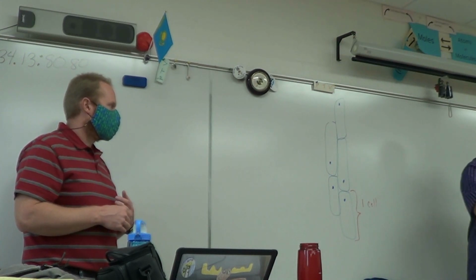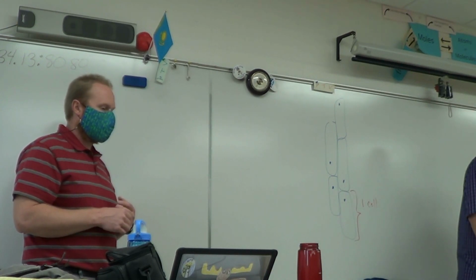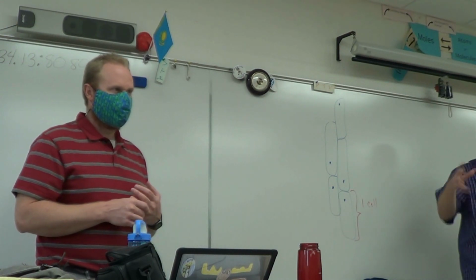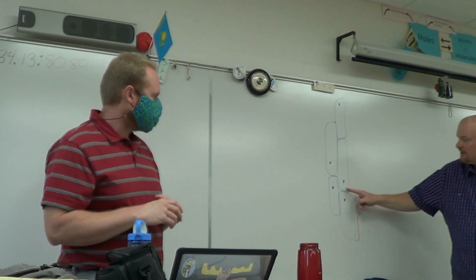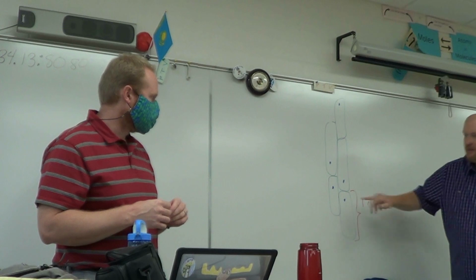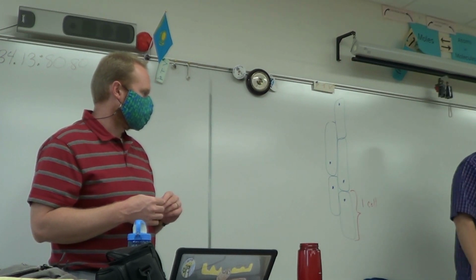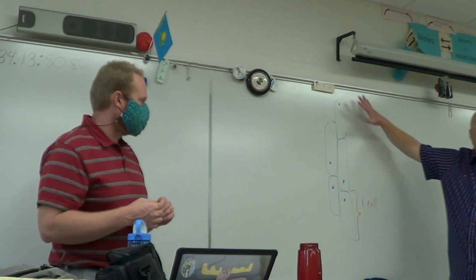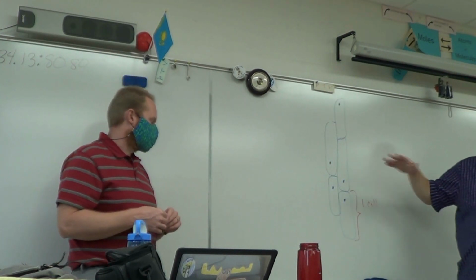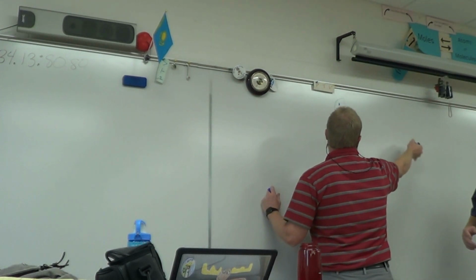So when it says draw one cell, in the case of an onion cell, find your cell wall, cell membrane, and you just need to draw one. Okay, so here's one cell. There's my nucleus. Maybe you'll be able to identify some other components, but just because you see it through the eyepiece, that's not one cell. Does that make sense? We just need you to draw one.